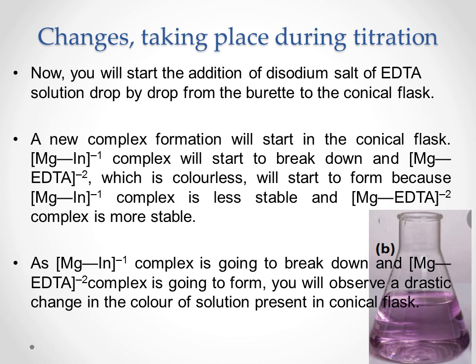होगा क्या, आपके पास रेड या पिंक कलर का जो solution है, that is because of magnesium indicator complex, वो ख़त्म हो रहा है after the addition of EDTA. Magnesium EDTA complex is going to be formed that is colorless. As magnesium EDTA complex is forming, simultaneously, you can see in the previous slide that along with the formation of magnesium EDTA complex, the free indicator is formed, that is blue in color.